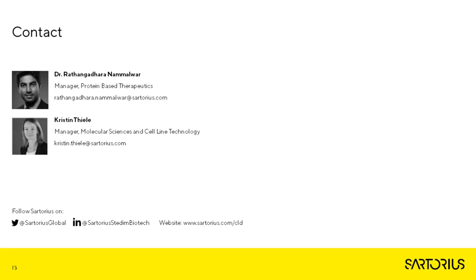So the last question for the webcast is the new expression vector already part of the CLD offering at Sartorius? So yes, it is part of the CLD offering. So we do have projects running with the latest version of the vector.